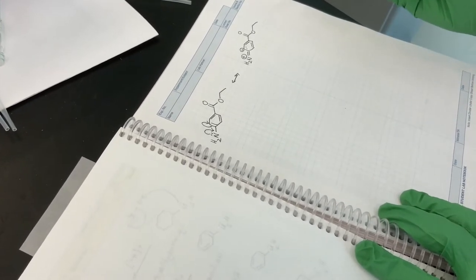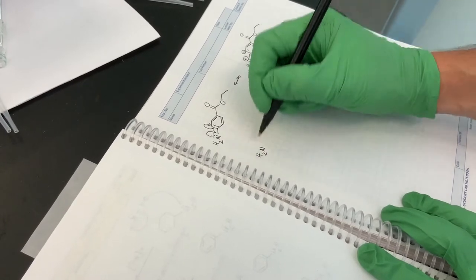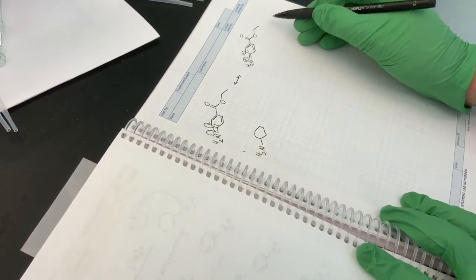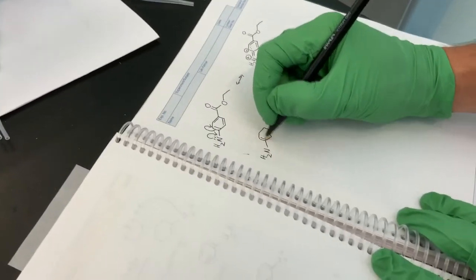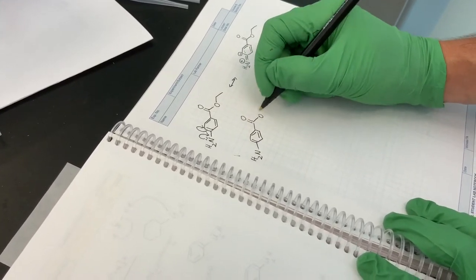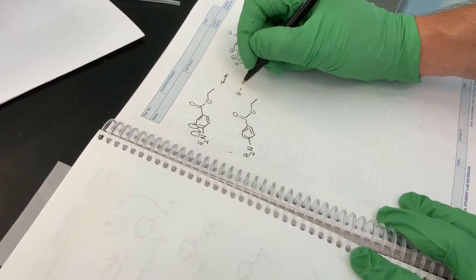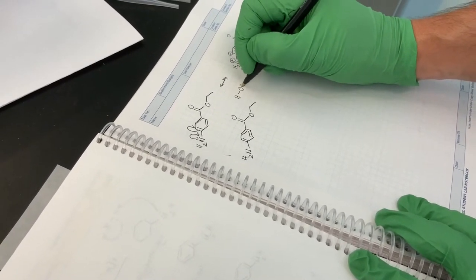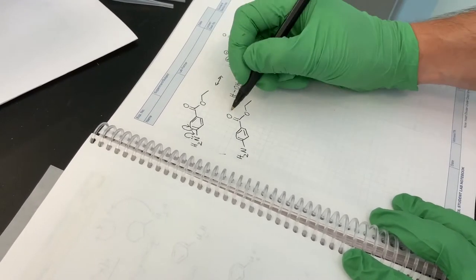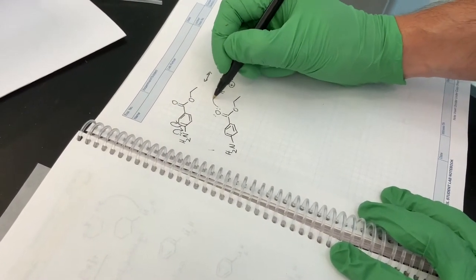So what I could show then is that if nitrogen is protonated directly, we then destroy this opportunity for delocalization. So what's most likely is that protonation will occur at this carbonyl oxygen. And so we're adding HCl, which is really hydronium chloride, 3 molar. And so I'm going to show that the carbonyl oxygen gets protonated.